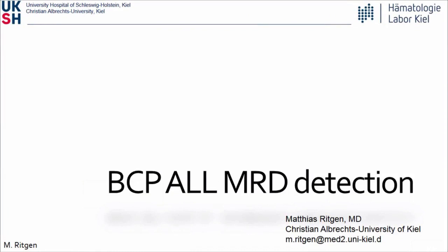The focus of today's webinar will be on minimal residual disease quantification of acute lymphoblastic leukemia by high-resolution multicolor flow cytometry.